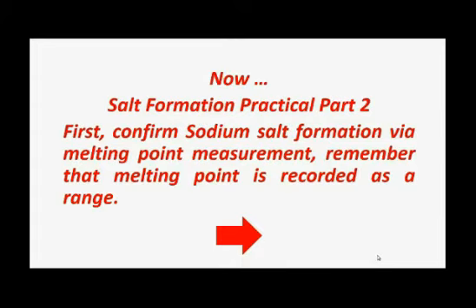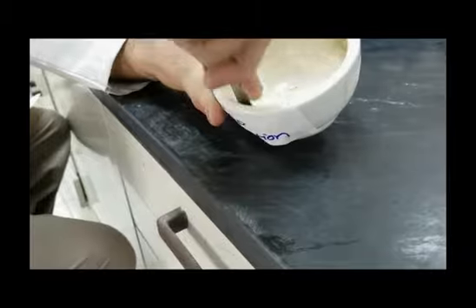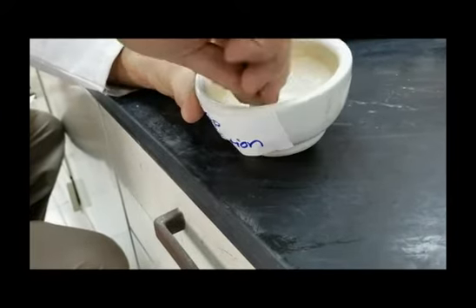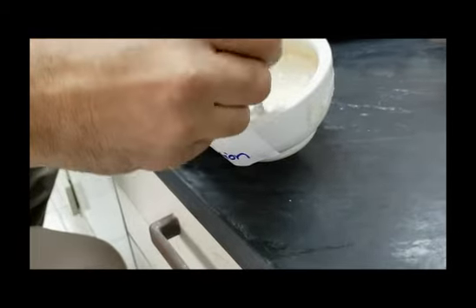Now, salt formation practical part 2. First, we need to confirm the sodium salt formation via melting point measurement. Remember that melting point is recorded as a range. Then, second, we will measure the aqueous solubility of both sodium mefenamate, the prepared salt, and mefenamic acid using the approximate solubility concept.